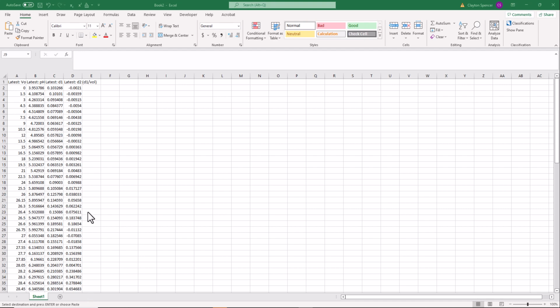You'll have one of these for each titration, so we're just going to go through one of these. You'll need to repeat this for your second set of titration data. You might want to get somebody else in your lab team to help you out with this, but you can of course share the first spreadsheet that you made. Okay, so let's set up a few things to begin with, some things we'll need.